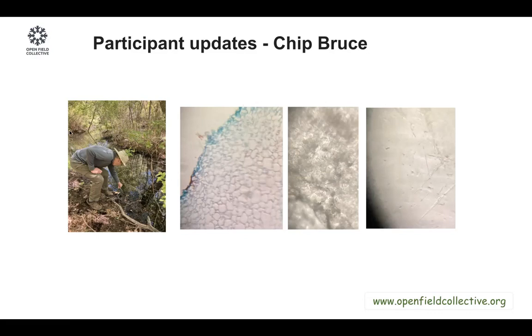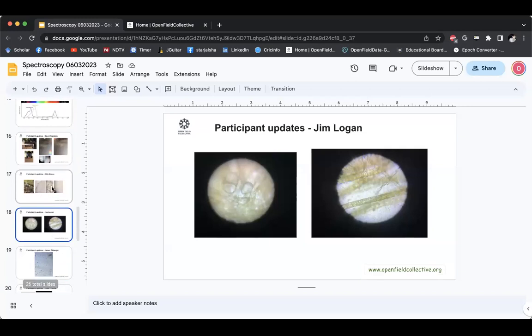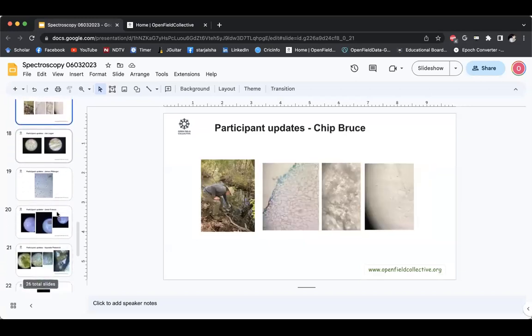Moss, yeah. What do you think these lines are? It looks like a little triangle and some other lines. What would that be? Yeah, these lines, I think, are lines on the plastic or glass, either the glass slide or the plastic cover on top of the ring stickers. So I think you were focusing on the plastic rather, and maybe there's nothing in the water across. So you were trying to focus and you find some patterns and you image that. Okay, well that helps. I just need to do more. I don't think these lines are active matter, like living things.